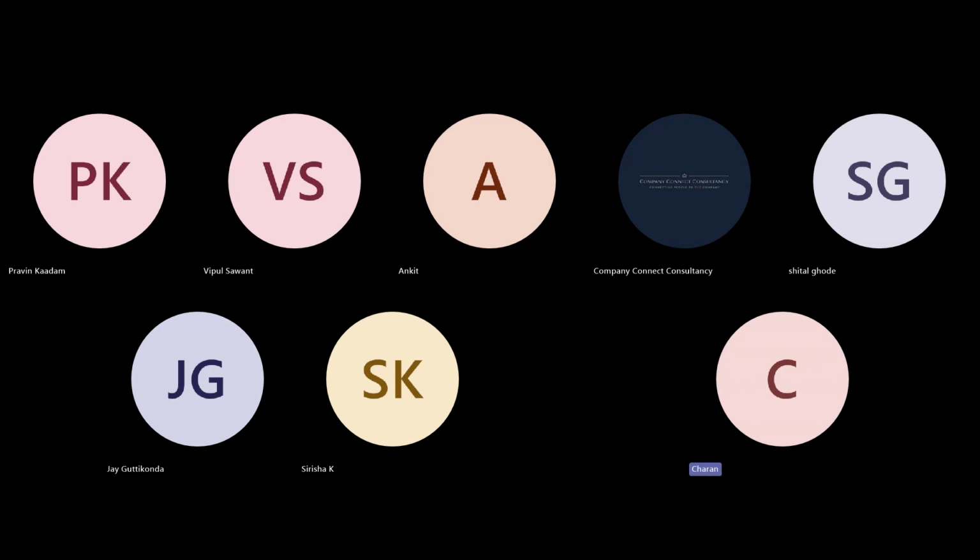Yes, sir. I will answer this question. Hi, Sheetal and Jabbar. Regarding raw materials and packing materials, when we get the consignment, we need to assign everything in SAP and generate a SAP batch number. The SAP batch number will get interlinked to the LIMS batch number. Whenever you request some material, your QA will approve it. Then the reconciliation will be done in SAP, and from there you will get the reconciliation amount into the LIMS. You will perform the testing and get the results. You will generate a COA, and the COA will come into SAP. Based on the COA, you can release the lot.